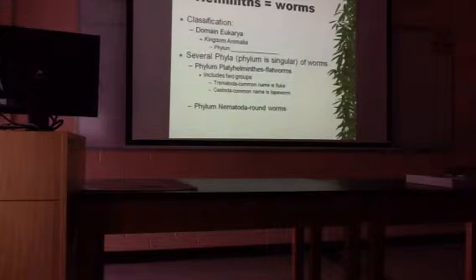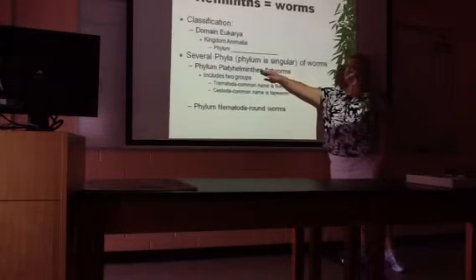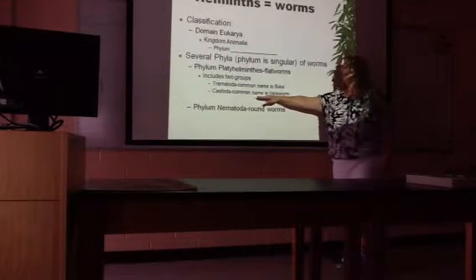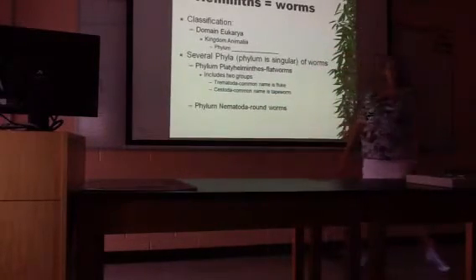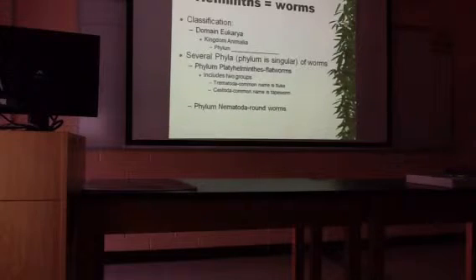The next 4, all 3 Taenias, all the way through Diphyllobothrium, big D word. Those are all phylum Platyhelminthes as well, but they're group Cestoda. Phylum Platyhelminthes, group Cestoda. And that was all 3 Taenias through Diphyllobothrium.